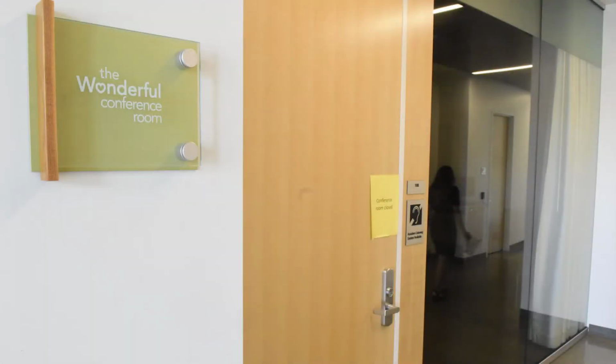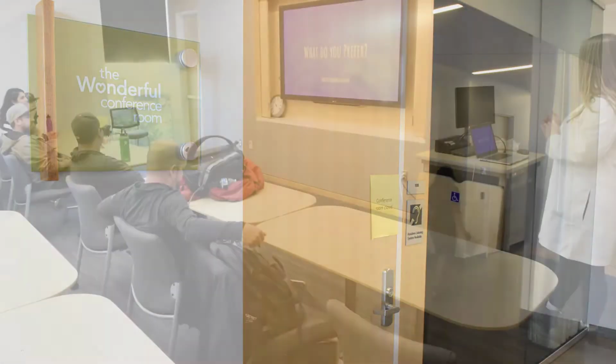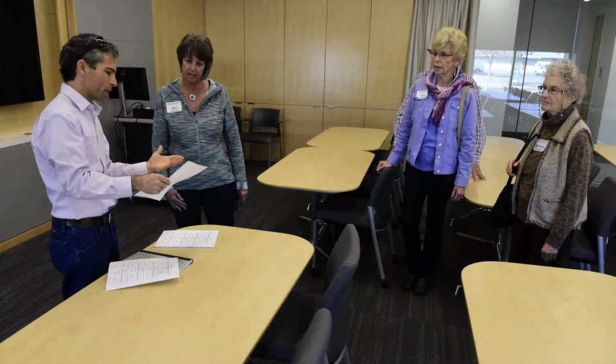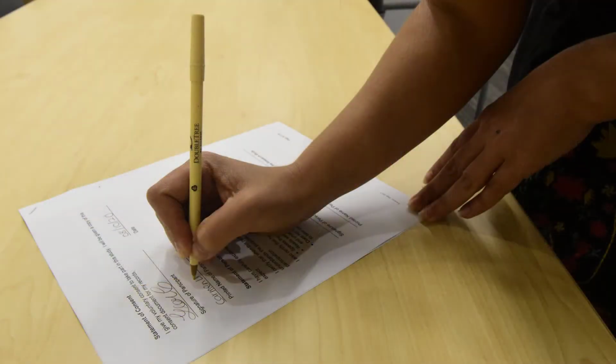This room can be used for training purposes, especially for descriptive tests. It needs to be large enough to have sufficient space between panelists and be equipped with good ventilation and good lighting. This room can also be used as a waiting area or to instruct the panelists or to sign the consent forms before executing the tastings.